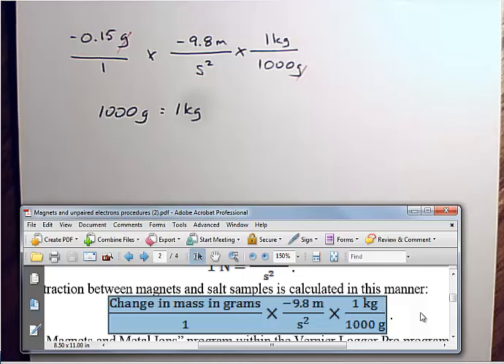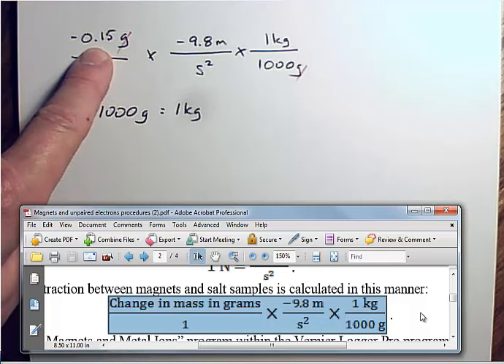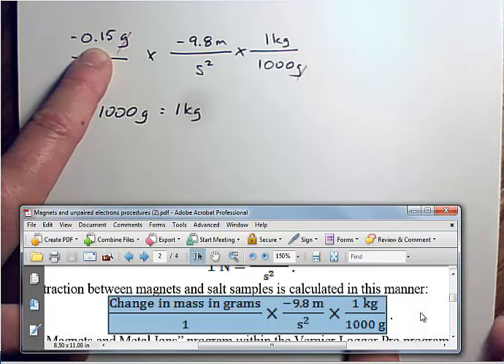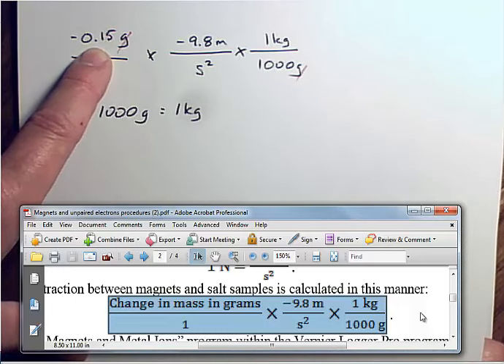That will be the force we're calculating here, just on this one measurement, or this average measurement. You have how many different chemicals you're testing? 6 of them. So you're going to have to do these calculations 6 times to be able to put together your graph. But I was nice to you by sending you a spreadsheet in your email, and all you have to do is plug it in one time if you just use the spreadsheet to do the work.